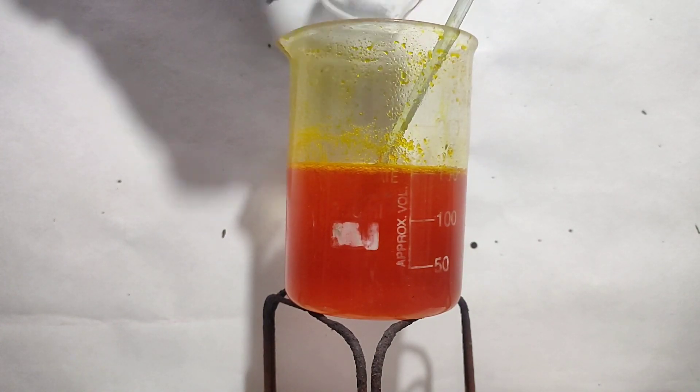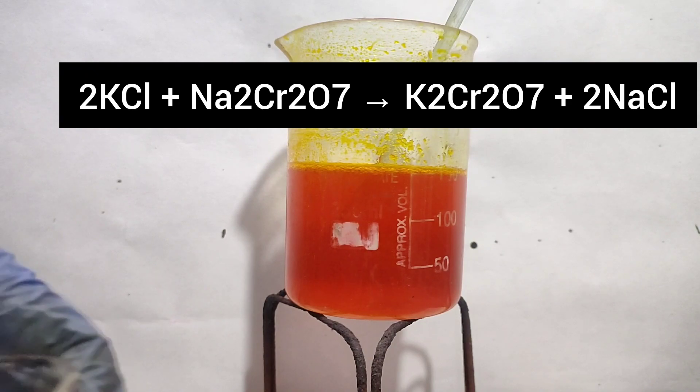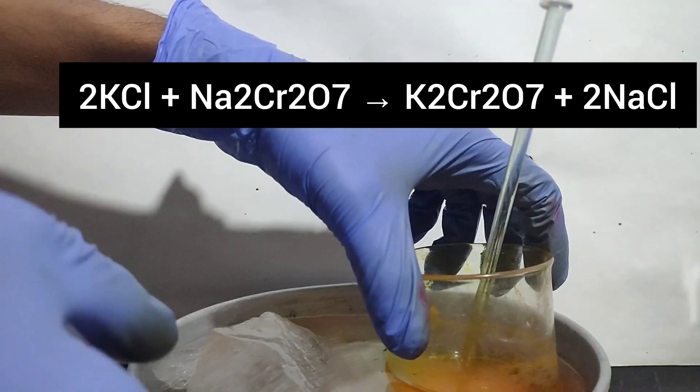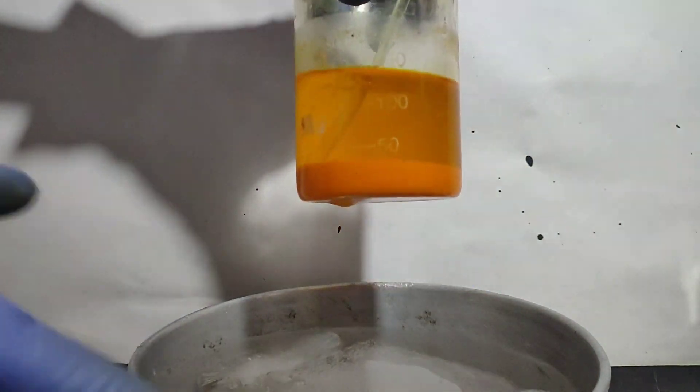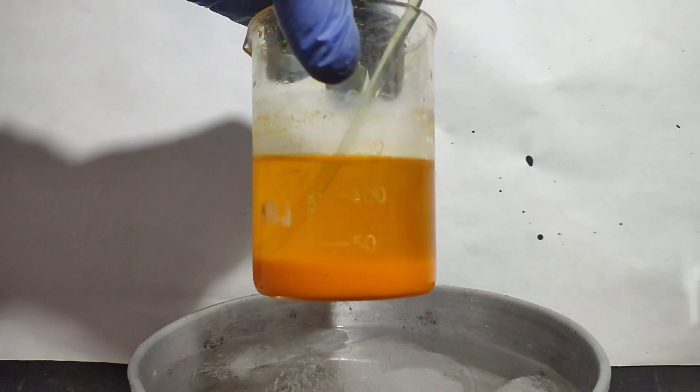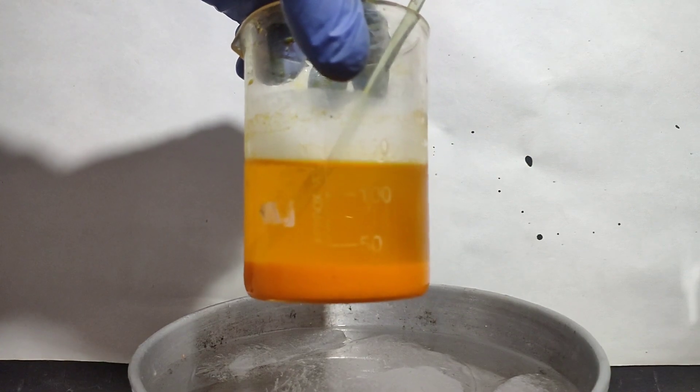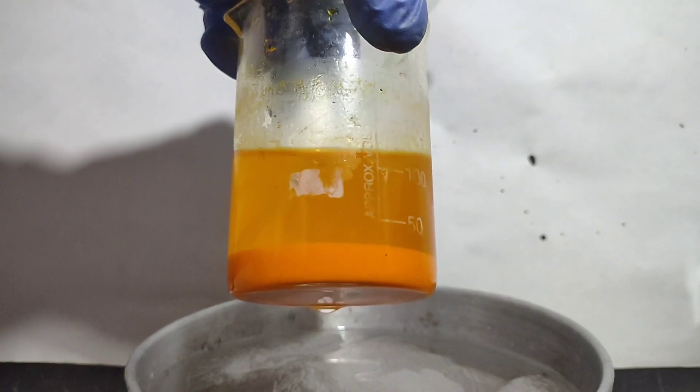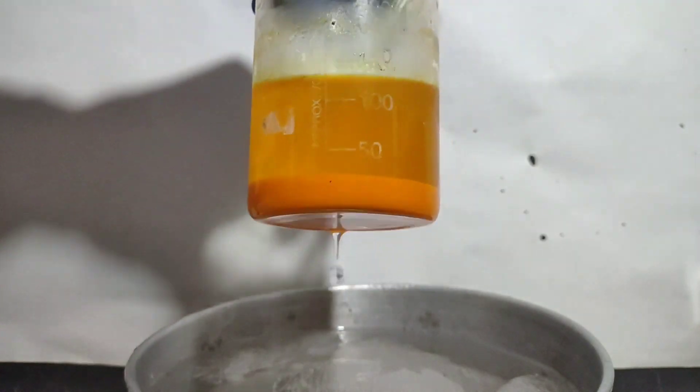Initially nothing happened as solution was very hot. But on keeping the beaker in ice bath for some time, orange crystals of potassium dichromate were formed, as potassium dichromate has very low solubility in ice cold water, that is 5g per 100 ml at 0 degree Celsius.